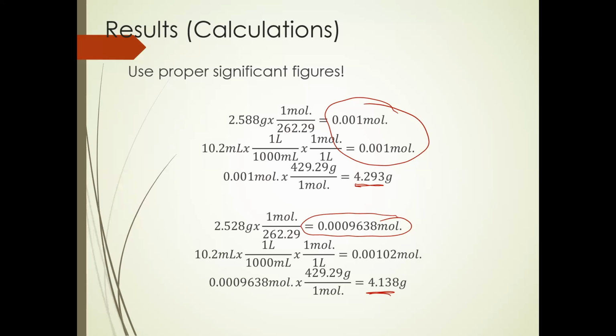I'm going to pause here for just a minute, talk about one thing that may be coming up with the chemical equation. The lab protocol for this shows the reactions that we're doing, and compounds are numbered. And so for the product, you'll have something like this, where it's showing the product, the nitrophenyl, and showing the ester, and specifically in this case, the trans, and underneath is a 5 that's in bold font.